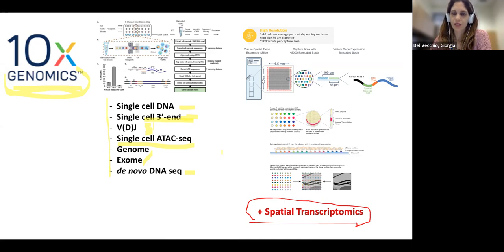So we have this slide here. The support does have this structure, with so many tiny spots with different barcodes.